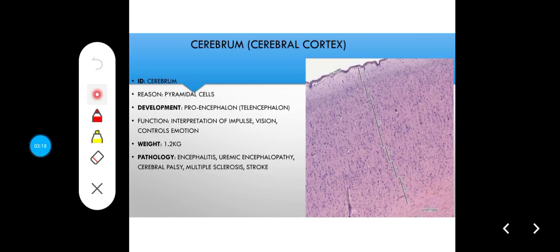Now, if you look at the cerebral cortex, you'll notice a kind of layering in the way these nerve cell bodies are distributed. There are some areas that are faint staining, especially the outermost area. It looks like it contains fewer black dots, fewer neurons, fewer cell bodies, and then the deeper ones contain more of the black dots, and there is a kind of gradual transition. So this represents the layers of the cerebral cortex.